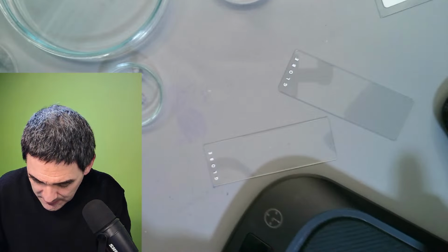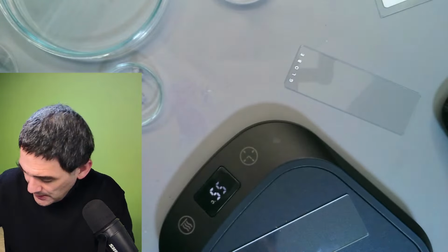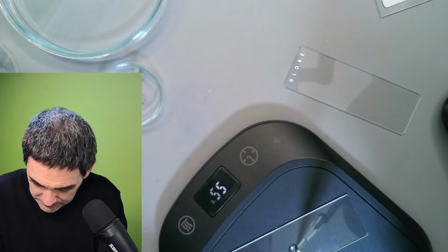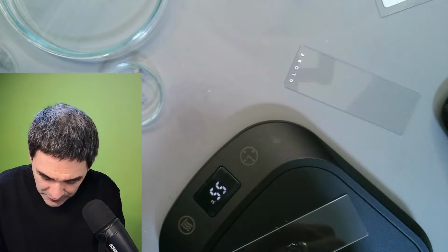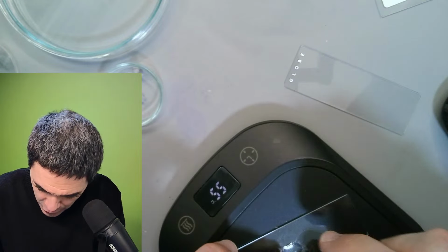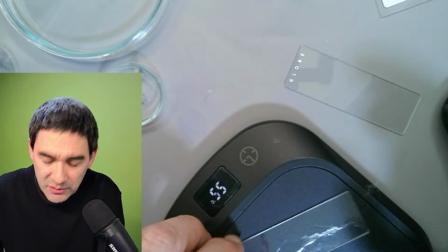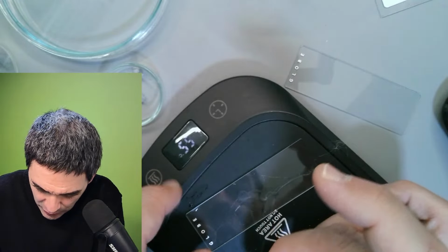So I take this here, I add a little bit of water. Again, I take a little bit of cotton as before, not too much. And you see, when you put it in water, then it sticks to the slide, right? And that's actually what I want.